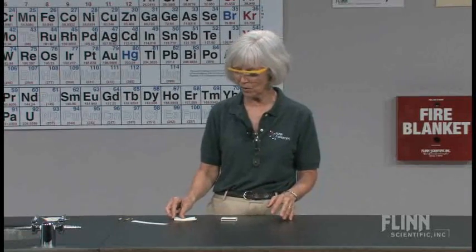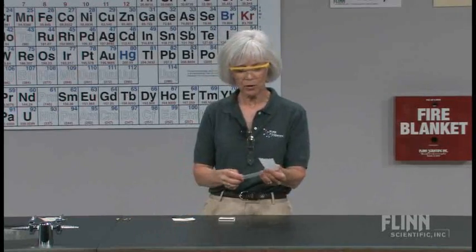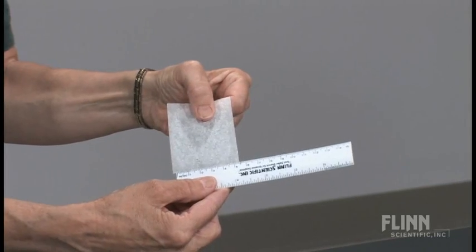There's a third opportunity where you could use this flash paper. I've used it as an assessment, or you could discuss it when talking about determining the rate of a reaction — specifically the appearance or disappearance of a product versus a reactant. I'll have the students make some measurements on the paper: they could measure its mass, or they could measure the length and the width and determine its area. They can make quantitative measurements on the paper, then burn it, time that, and come up with a rate for that particular paper.